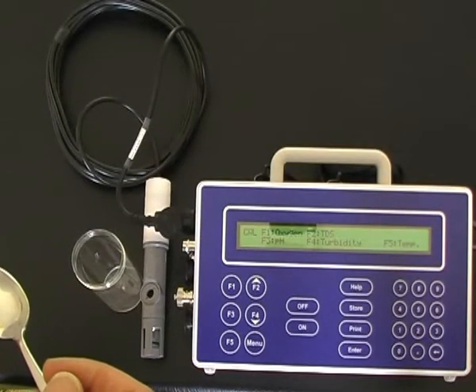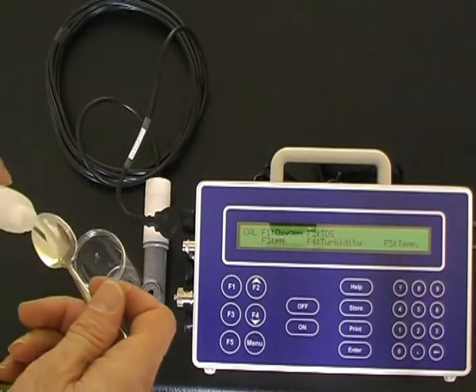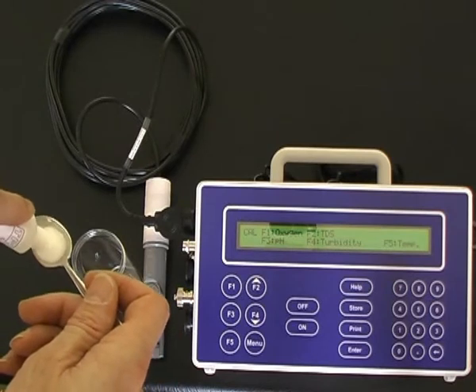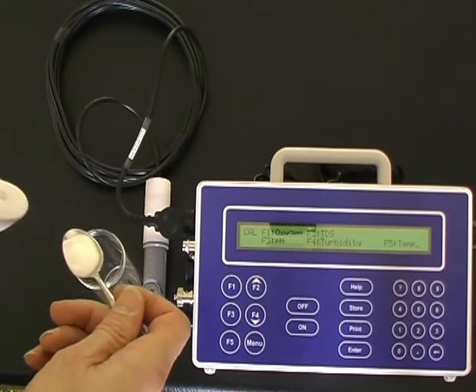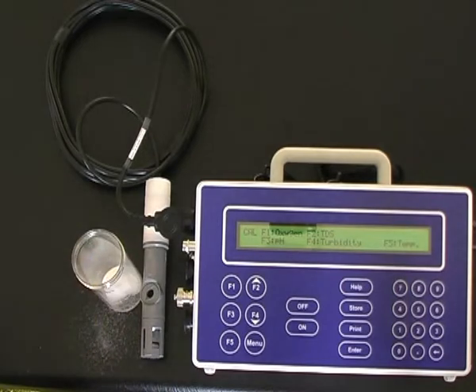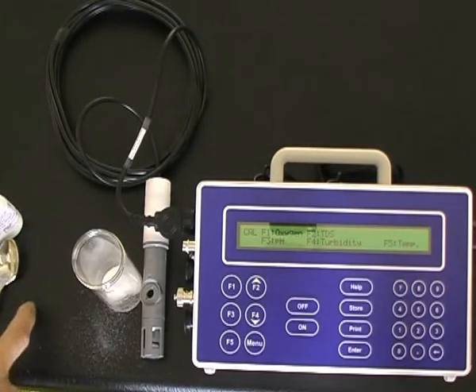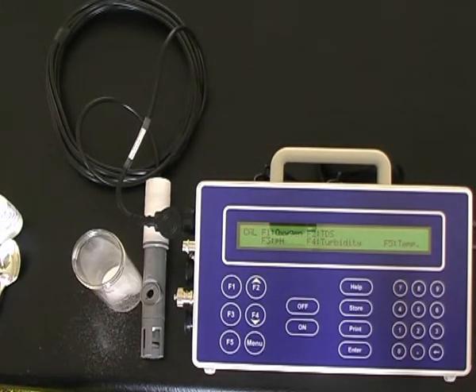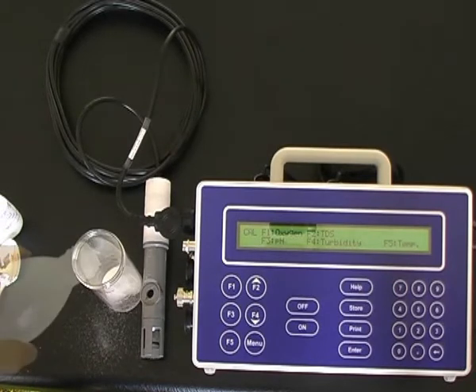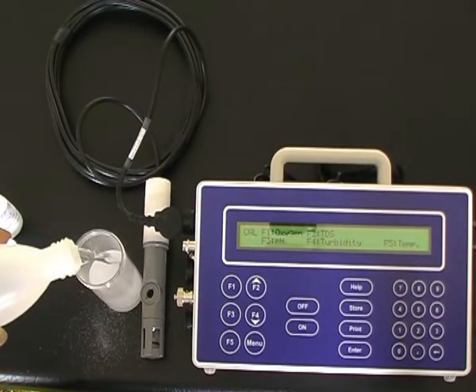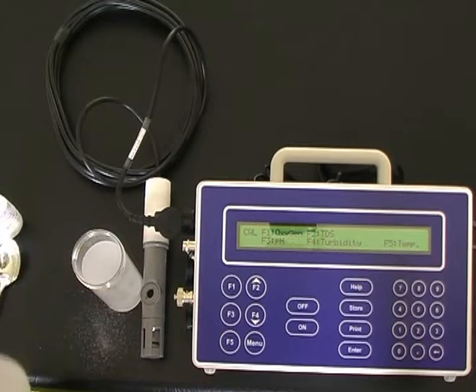To prepare the sodium sulfite zero solution, pour a teaspoon of sodium sulfite powder into a jar and add 100 mils of water. Stir the solution until the powder is completely dissolved.